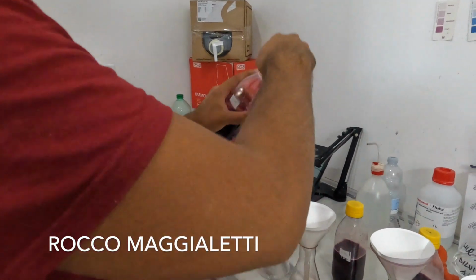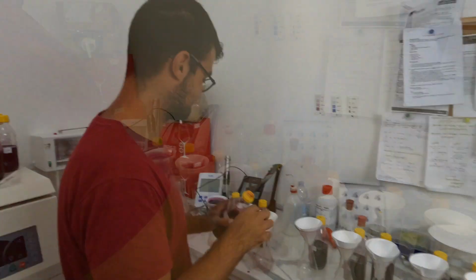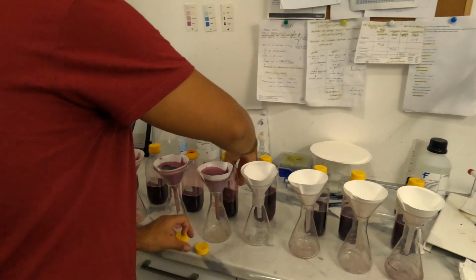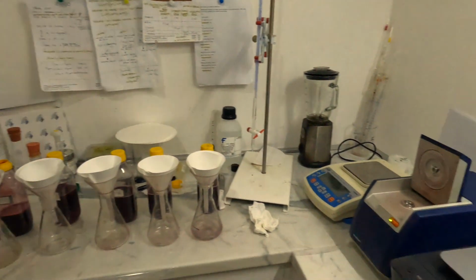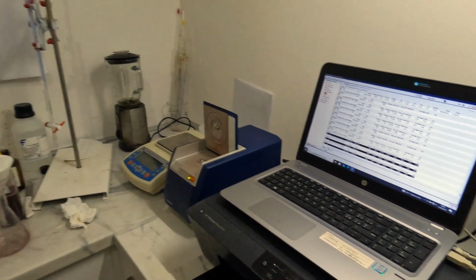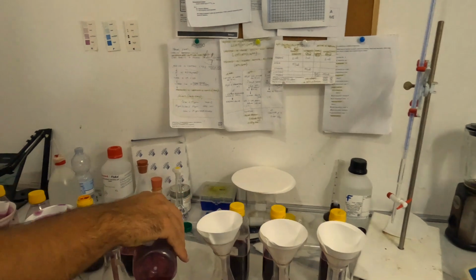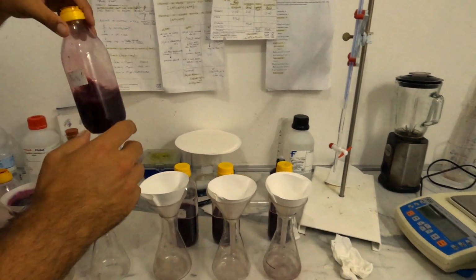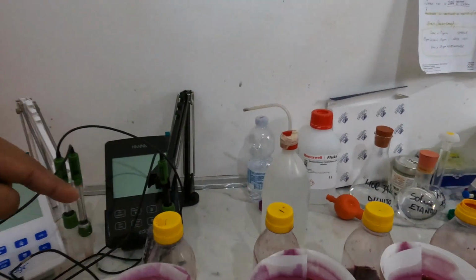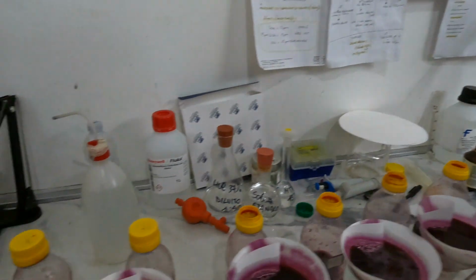Just filtering the wine for two analyses in the Wenopos. Then we analyze this in the machine, in the machine, right. Wenopos, to evaluate the fermentation. Right. So sugar, alcohol, and other parameters. Right. Acidity. You talked about pH earlier. Yep. Okay. From day 1, day 2, 3, 4, 5, 6, 7, 8 days?